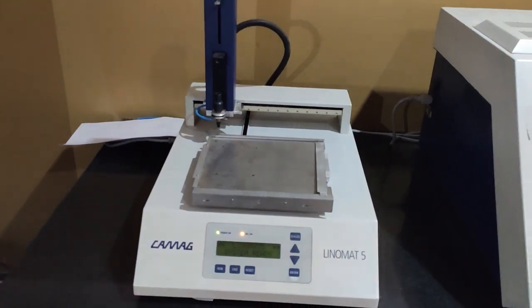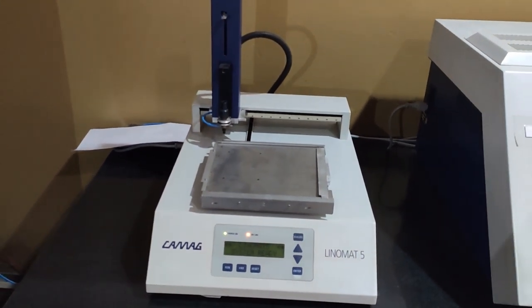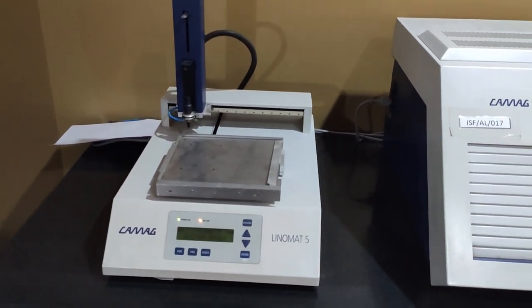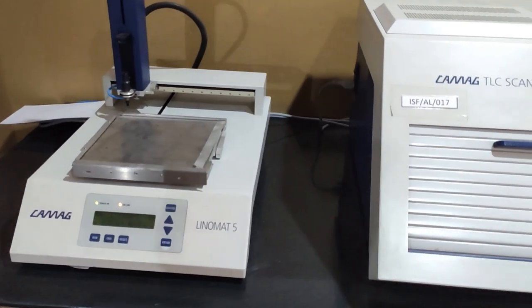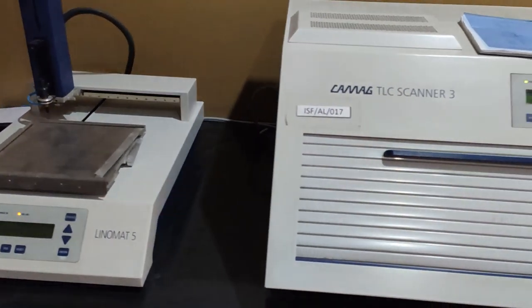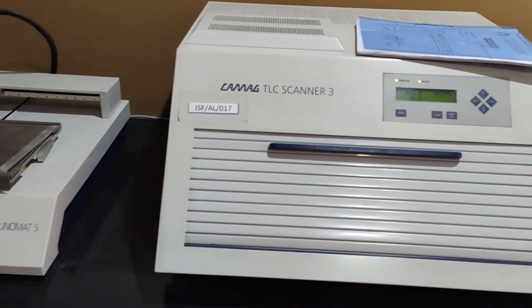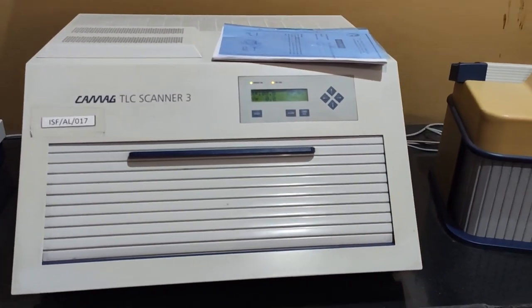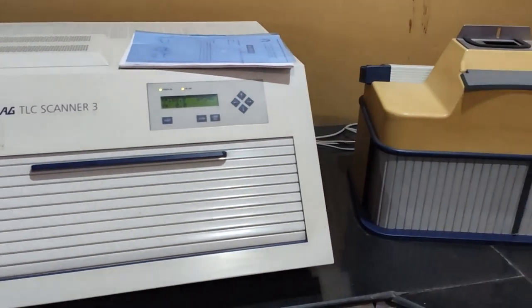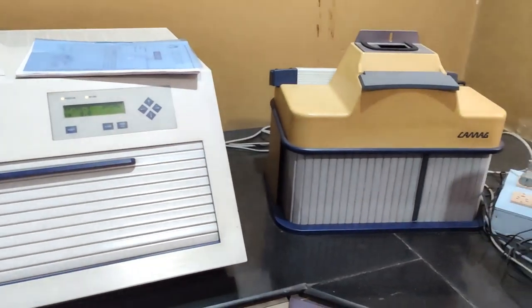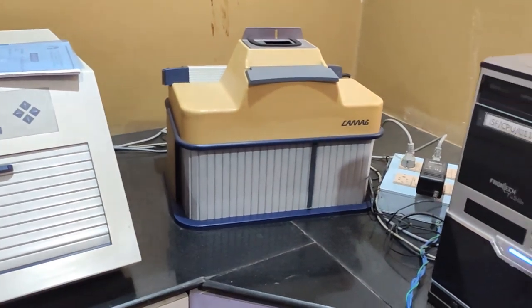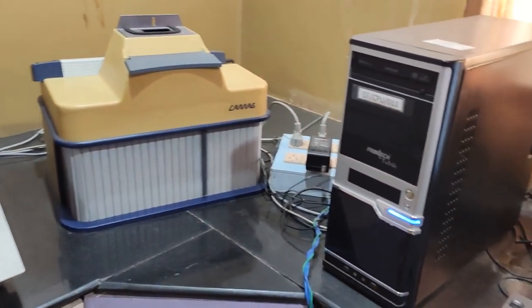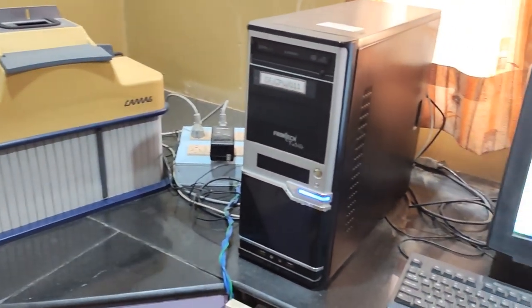Today we are going to conduct the training on HPTLC. The unique feature of this instrument is it is fastest, simplest, most economical, flexible, visible technique which can analyze in parallel more than 100 samples.